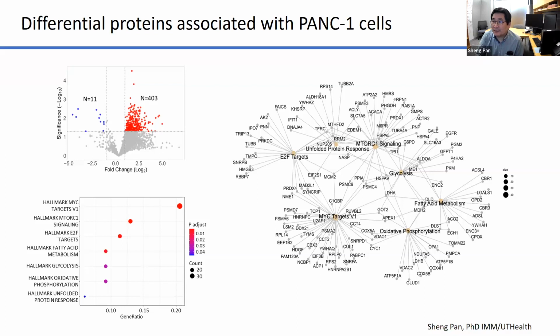heavily interactive between themselves. So I hope the data shown in these few slides can show you how single cell proteomics can help us reveal the proteome landscape and detailed information that we cannot obtain from bulk scale analysis.